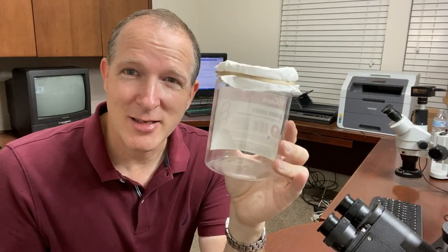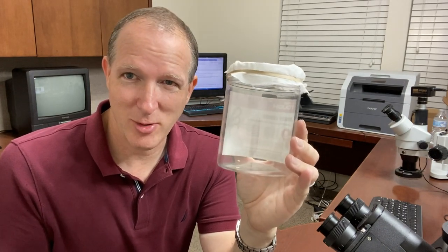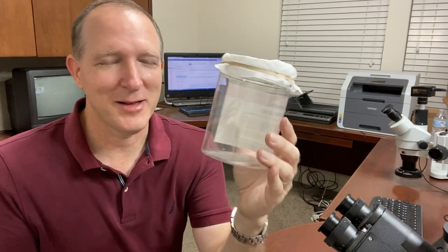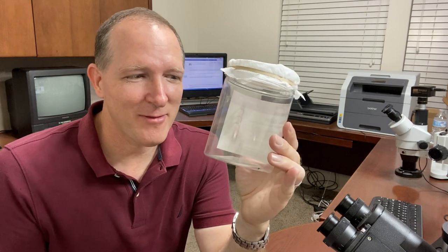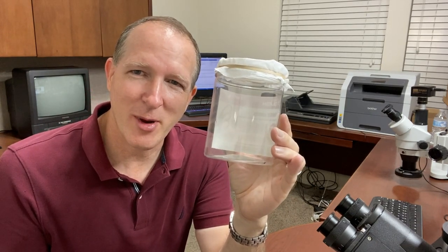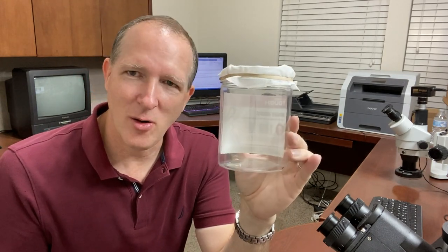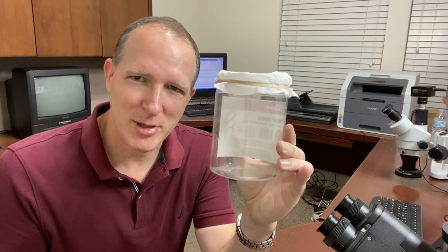You know, it's not easy finding a mosquito, letting it suck your blood, and then catching it. I learned this. It takes a little while to get it just right. Anyway, I have in my hand here a mosquito that has sucked blood from my arm. I was able to catch it. And right now, hopefully, it's digesting my blood in its abdomen.